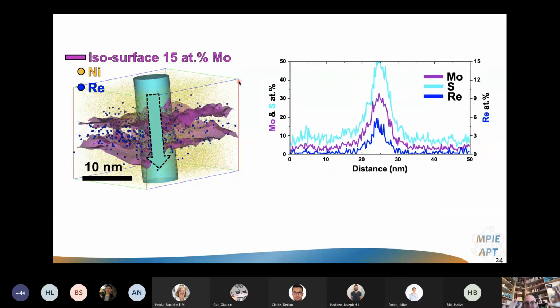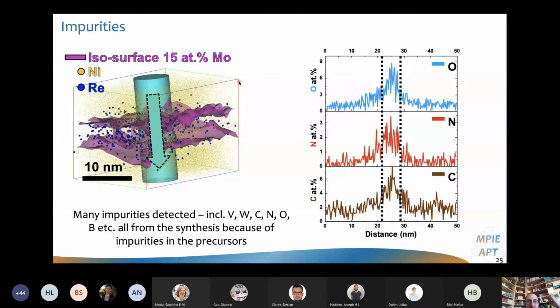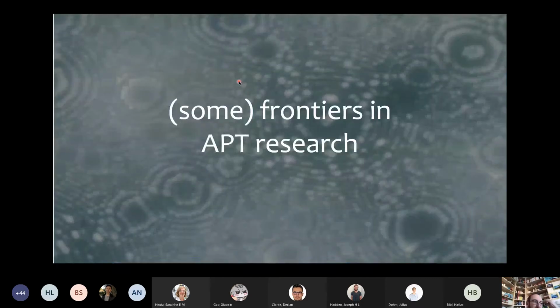So up to now, I've mostly talked to you about more or less conventional atom probing, or stuff that we've been able to do almost anywhere where there's an atom probe, which is, there's about 100, I think, in the world at the moment that are active. And to give you an idea, when I was a PhD student about 15 years ago, there were about 20. So there's a very strong rise in the number of people who are using the technique, which is good, but also in terms of number of things that we are trialing.